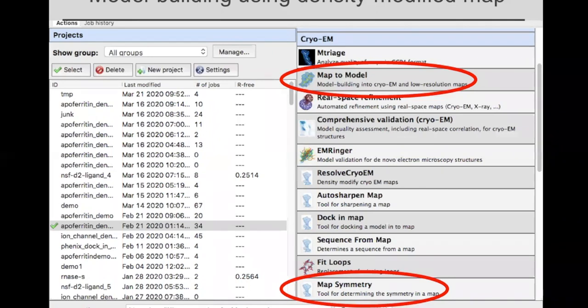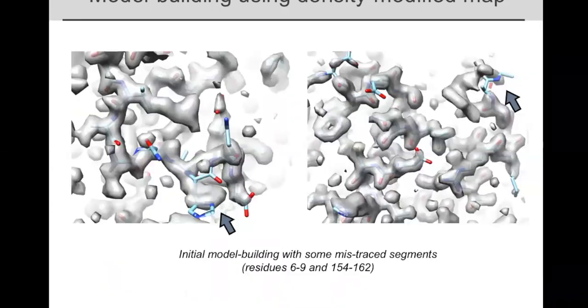So these are 2 snapshots of parts of this human apoferritin. What you notice in these snapshots, let's look at the one on the right here. Part of the map is built, the model looks great. It fits the map extremely well. And you can see all the hydroxyls, and you can see our tryptophan. It looks terrific. And so most of the model looks like that.